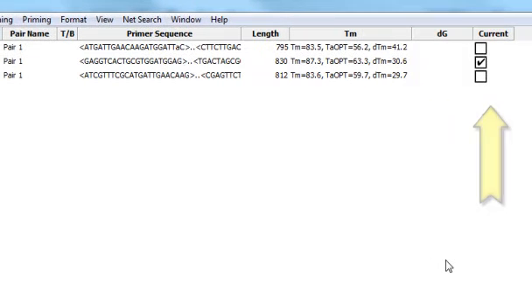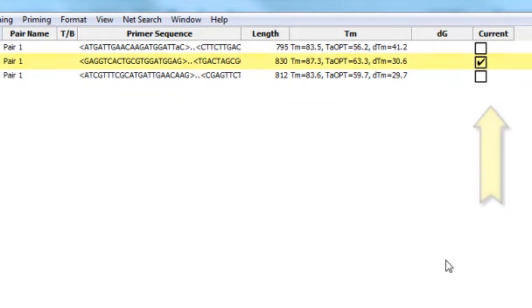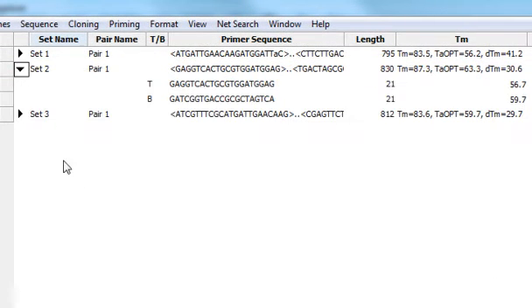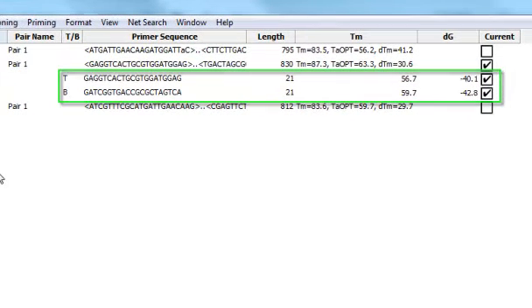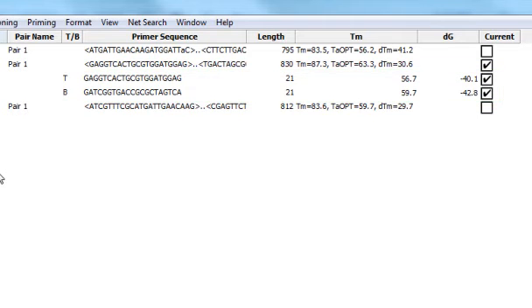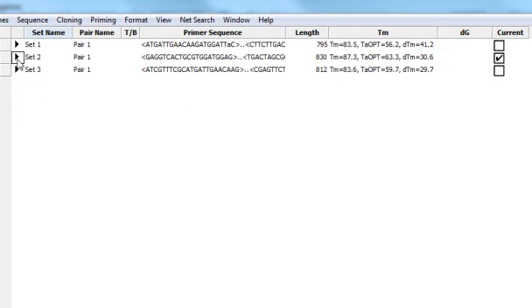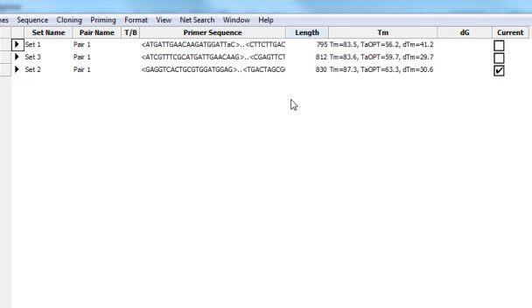The current column shows you which pair is currently selected and displayed in the primer design view. By expanding each pair, you can see additional information about each individual primer within the pair, including the primer length, its melting temperature, and its delta G value. Notice that this view is set up like a spreadsheet, so you can easily sort it by clicking on any of these column headers.